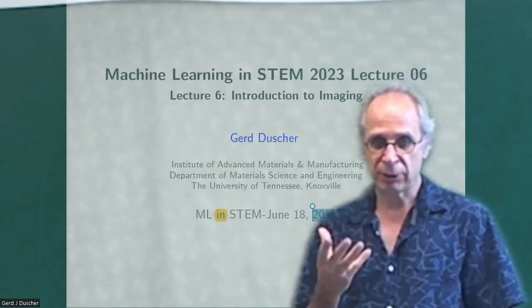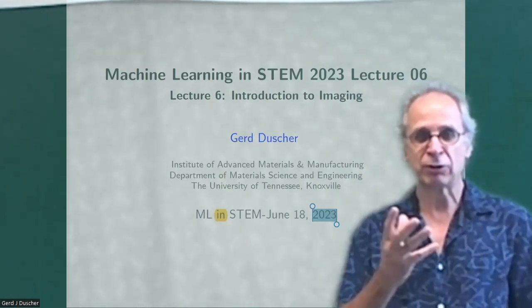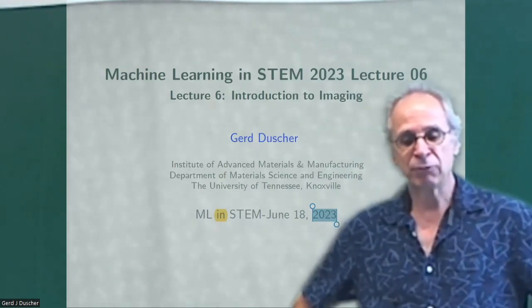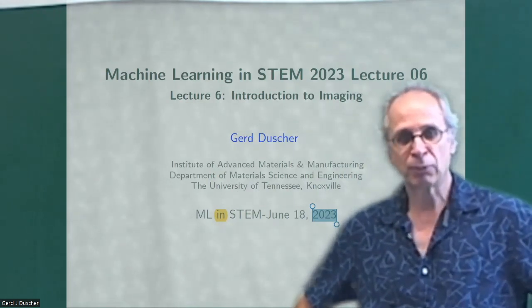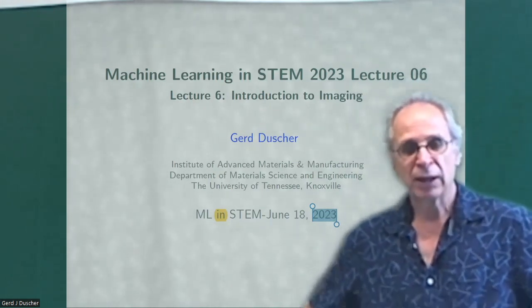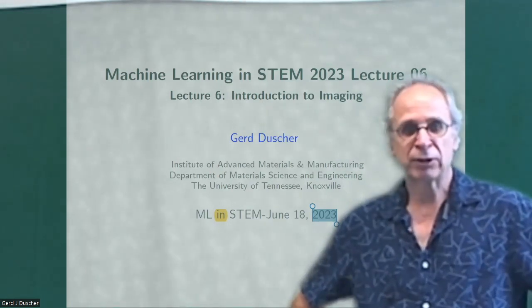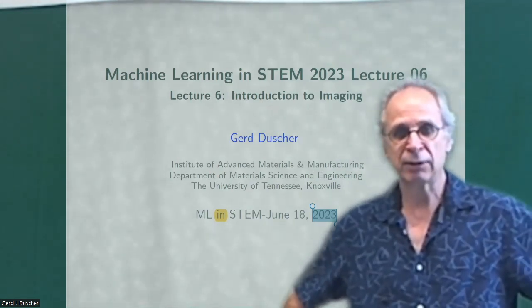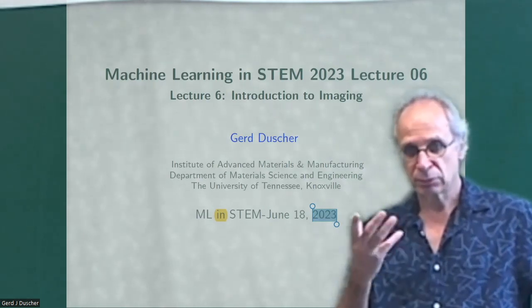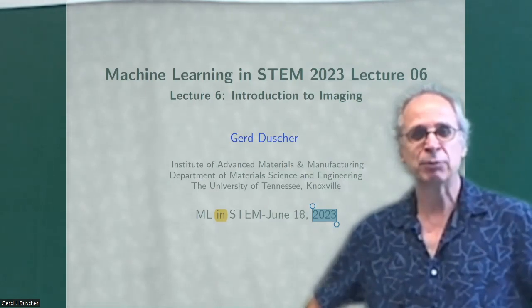When we talk about imaging in scanning transmission electron microscopy, we are talking about aberrations and how spatial information gets transferred from the sample onto our detectors. So that's what we want to do today. On Friday, we will talk about atomic resolution STEM and structure determination, finding atoms, how to handle them, and so on.